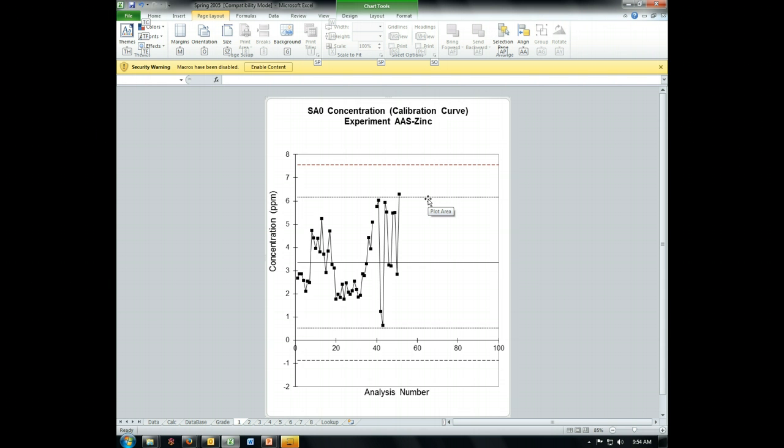In the 8th edition of our textbook, you can see this sort of thing on page 99 in that little box. If you have the earlier edition, just look for the box that has control charts in it, and you'll actually see that there's a little graph there that shows something that's very similar to this. It describes this as being the target value.